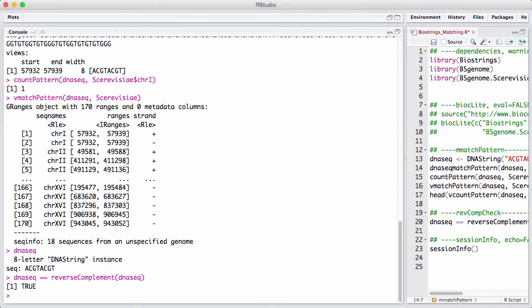Finally, there's a set of functions called matchPdict that's called pdict for dictionary. It takes a set of sequences such as short reads of the same length. It builds a dictionary on them, and then it matches them up against the full genome.